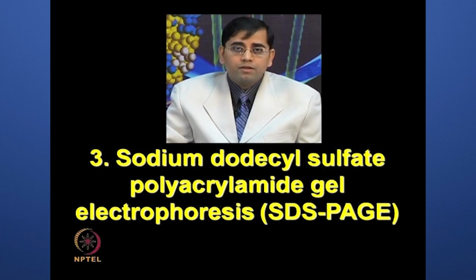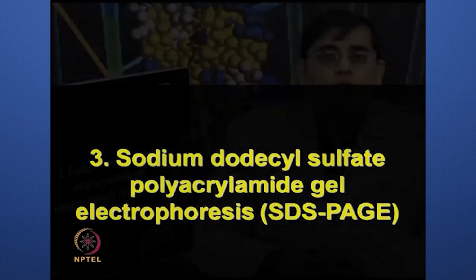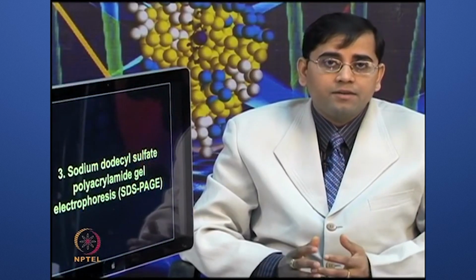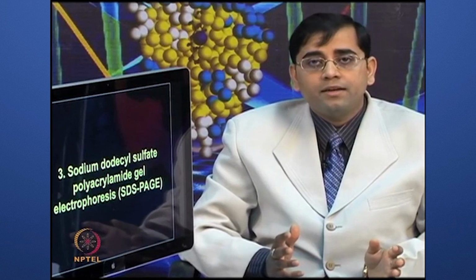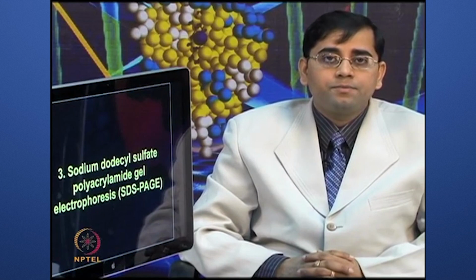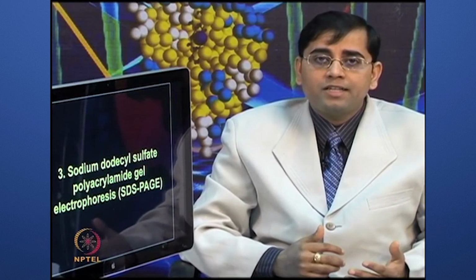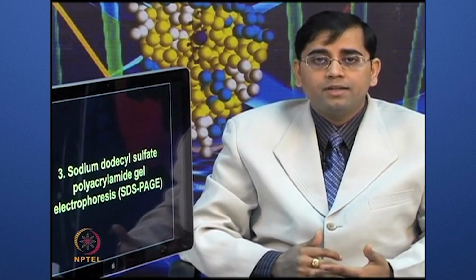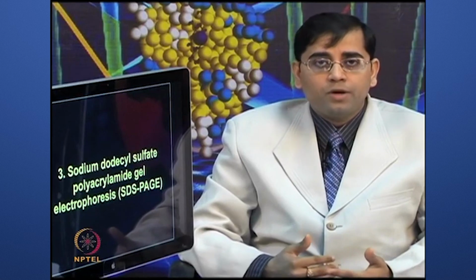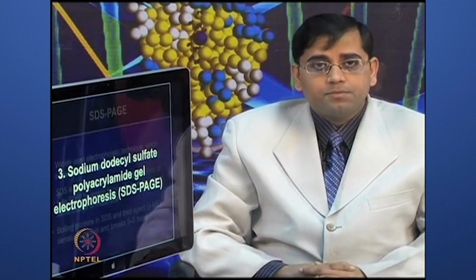Now, in this case, when you are using SDS page only in the second dimension of 2-dimensional electrophoresis, then you do not need to add the stacking gel, because you have already focused the protein in the gel in the first dimension based on the IEF. Now, for the second dimension separation, you have already prepared the strip to be loaded on the SDS page gel. So, the rest of the steps can be uniform or similar to what one can expect in regular SDS page.